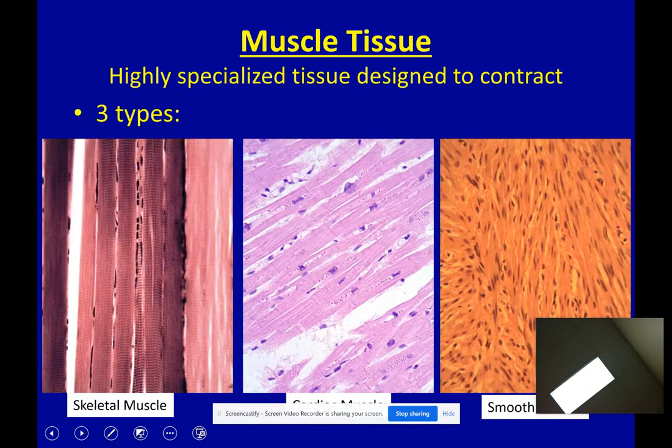All right. So with skeletal muscle and cardiac muscle, when you look, you'll notice that they all have these little stripes on the actual muscle themselves. But you'll also notice that these are very, very long. They're the fibers that we were talking about earlier.